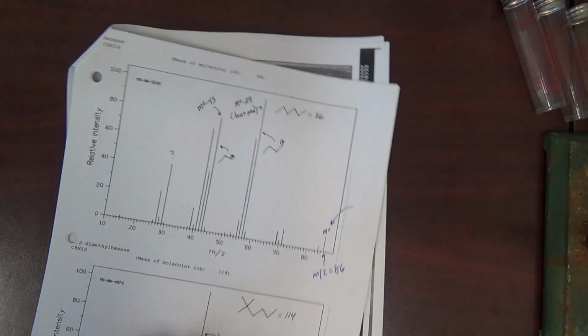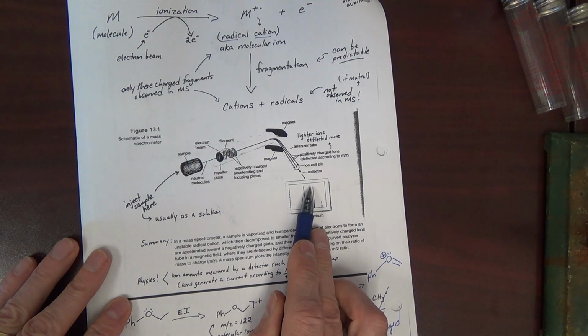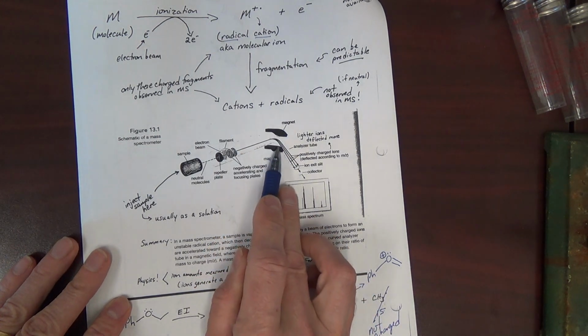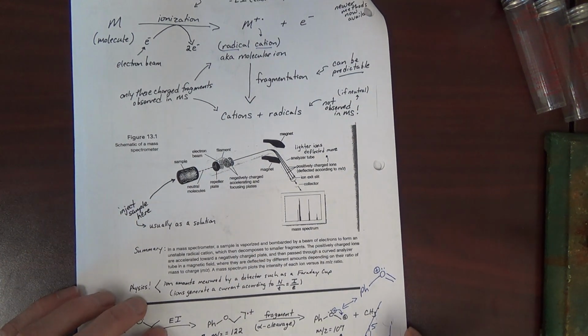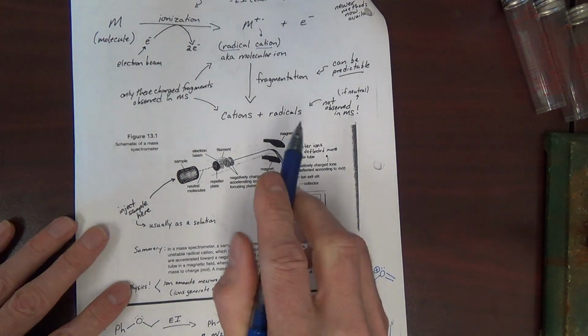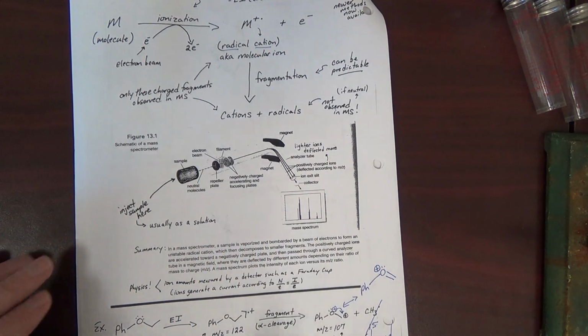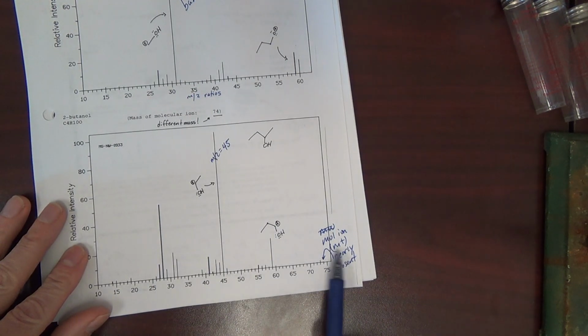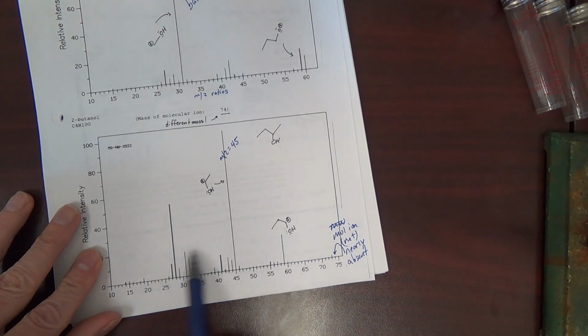Now let's talk about that briefly. The molecular ion can be formed, and it can survive and hit the detector. Or along the way, it can fragment, and then fragments hit the detector. Usually both occur. Sometimes the molecular ion may not survive. As soon as it's formed, it fragments before it hits the detector. And that's most likely what happened back over here with this compound. The molecular ion did not survive and never hit the detector. The only thing that hit the detector was the fragments.